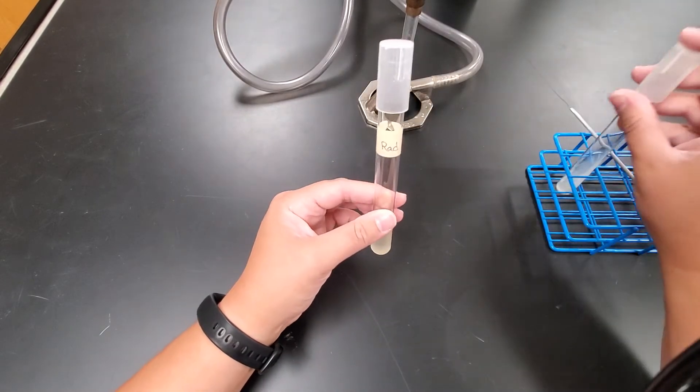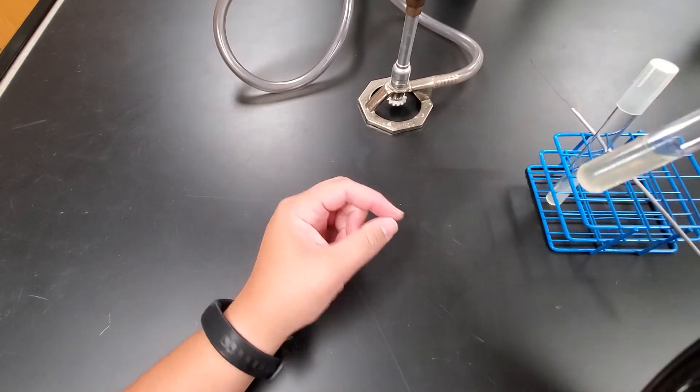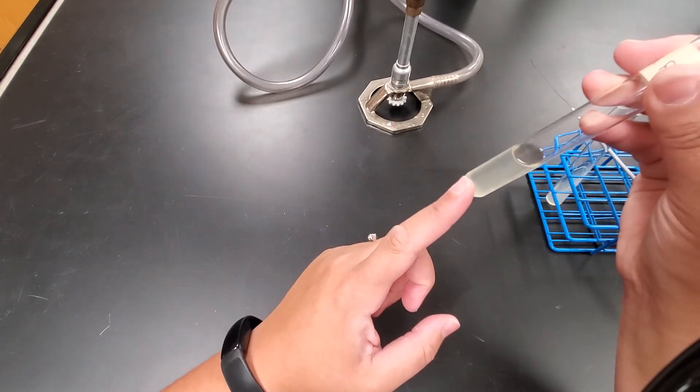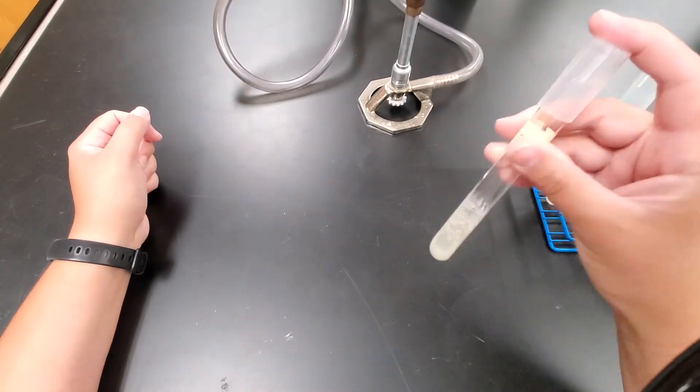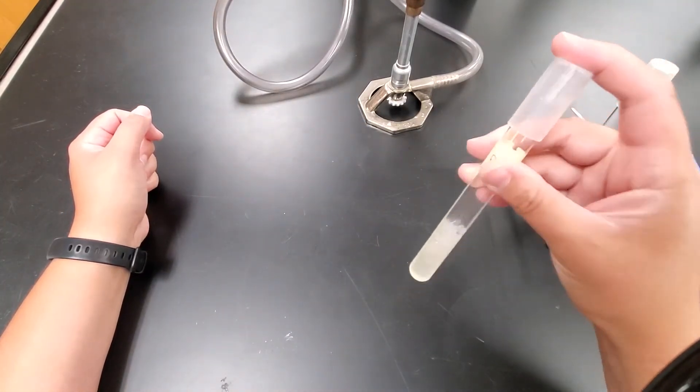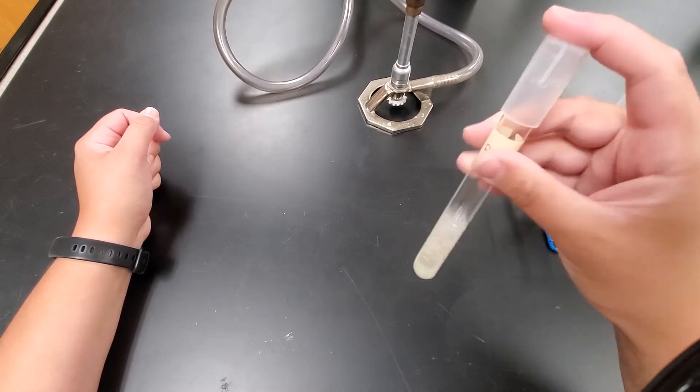So what we want to do first is whenever we do a transfer, especially with broth, all of my growth is at the bottom of this tube. The first thing I want to do is shake that up so I can suspend the bacteria that's now in that broth.